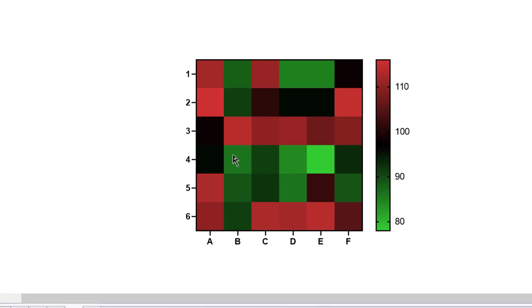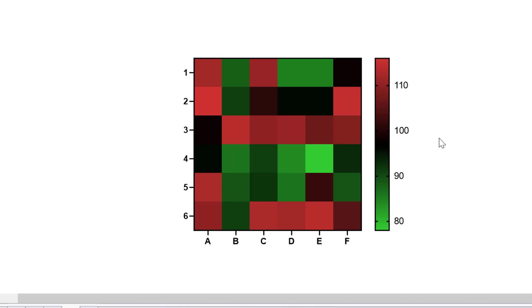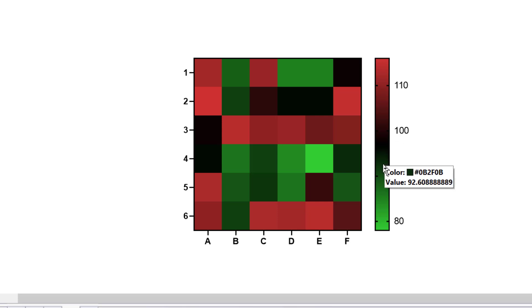By scrolling over each cell in the heatmap, you can see the actual value — for example, this one here has a value of 114. If you scroll over the gradient key on the right, you can see what each different shade of colour represents; for example, this shade of black represents a value of 92. At the minute, the column and row labels are simply letters and numbers, which is not very informative. It would be more helpful if these were labelled by their corresponding tissue type and gene names.